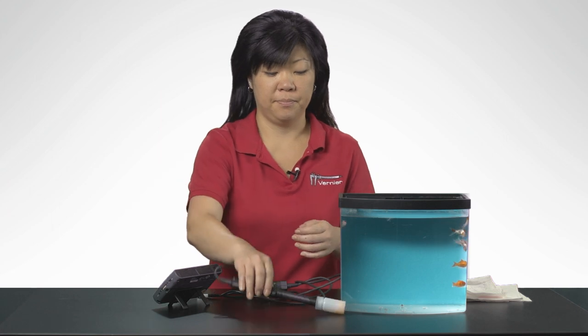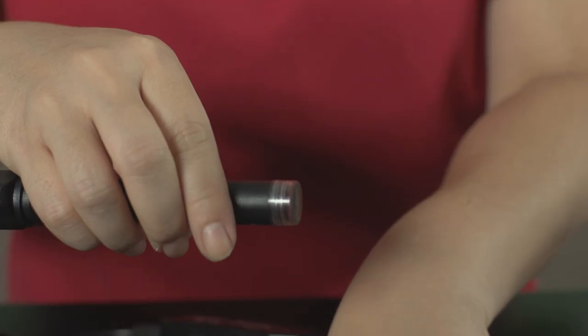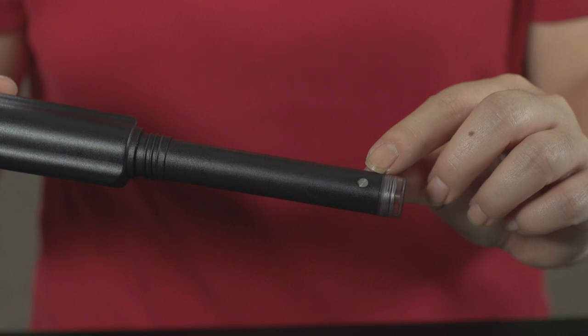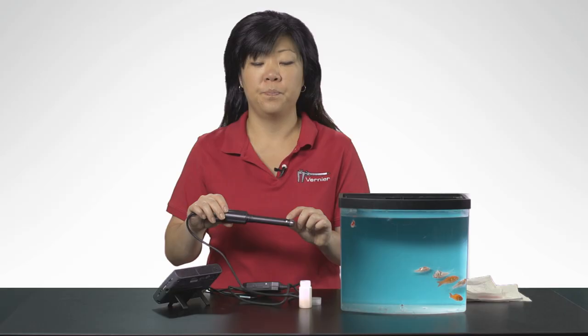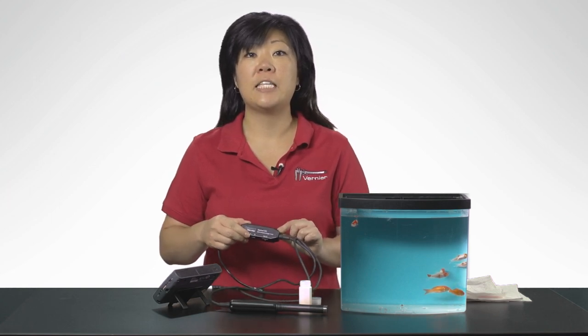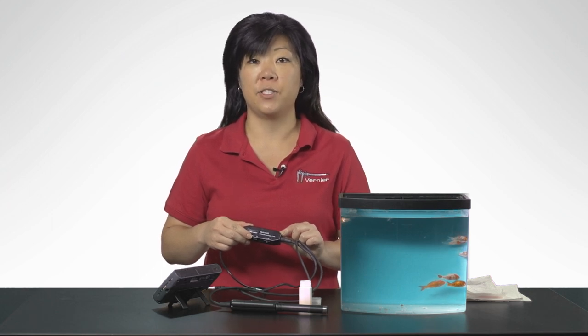The optical DO probe has a built-in thermistor for automatic temperature compensation. Be sure to keep this metal dot submerged for the temperature compensation to work. A built-in barometer is used for pressure compensation. These features eliminate the need to recalibrate the probe at different temperatures and elevations.